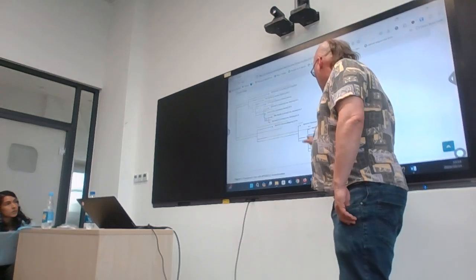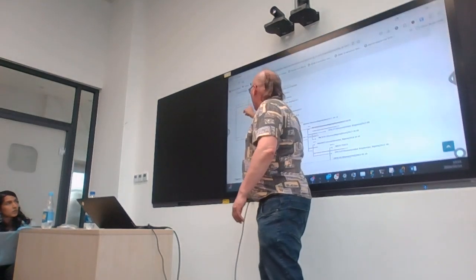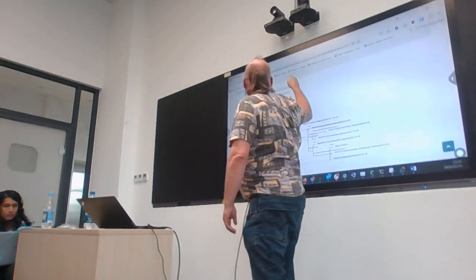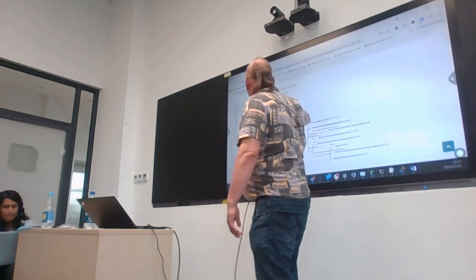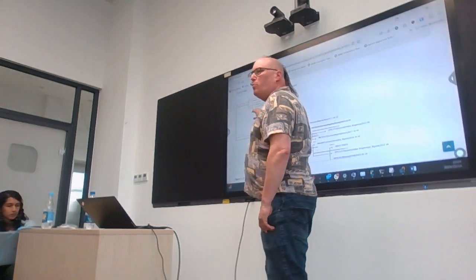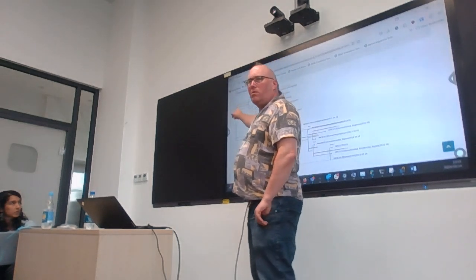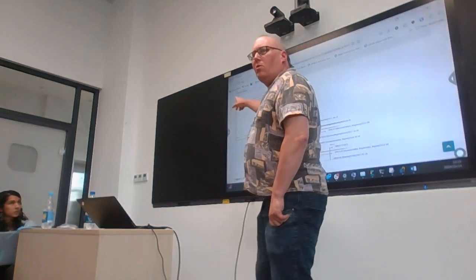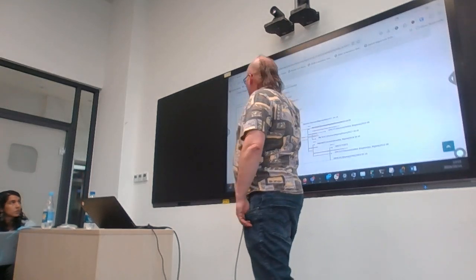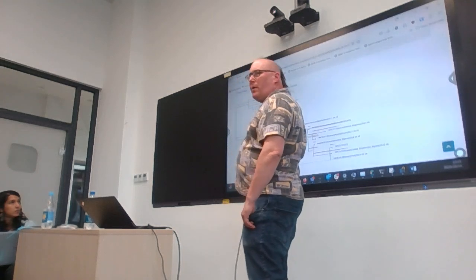So you see here, most of the mutations are measured from the common root. We see here long mutations from the roots, and this part is the introduction into humans repeatedly of clade 2, because we know it's not circulating in humans. It's almost certainly not circulating in humans because most of the mutations compared to the reference are not APOBEC.